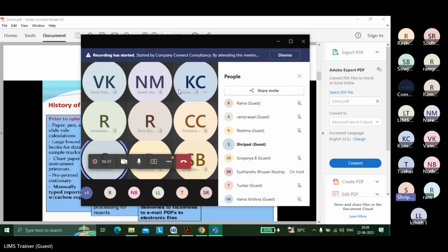I will perform the analysis and record the result, and the results will be in the LIMS. So it will be an easier task for traceability: on what day, at what time, and which analyst exactly performed this test. This will be the traceability for the particular test, analysis, batch or product. It will be an easier tool to search or trace the particular test, product, analysis and date.